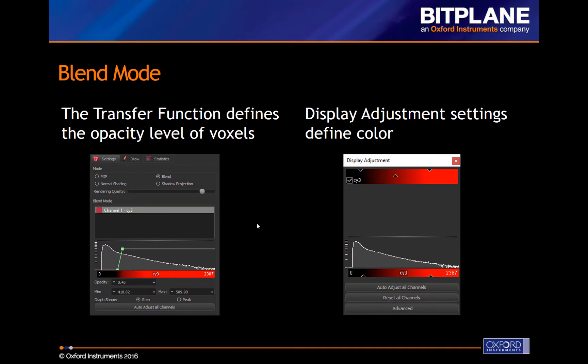The Blend Transfer Function is now found under the Volume Settings tab for Blend Mode. It defines the opacity of the voxels in the rendering. The transfer function is overlaid on the intensity histogram, and its vertical axis is opacity — full opacity at the top and full transparency at the bottom.